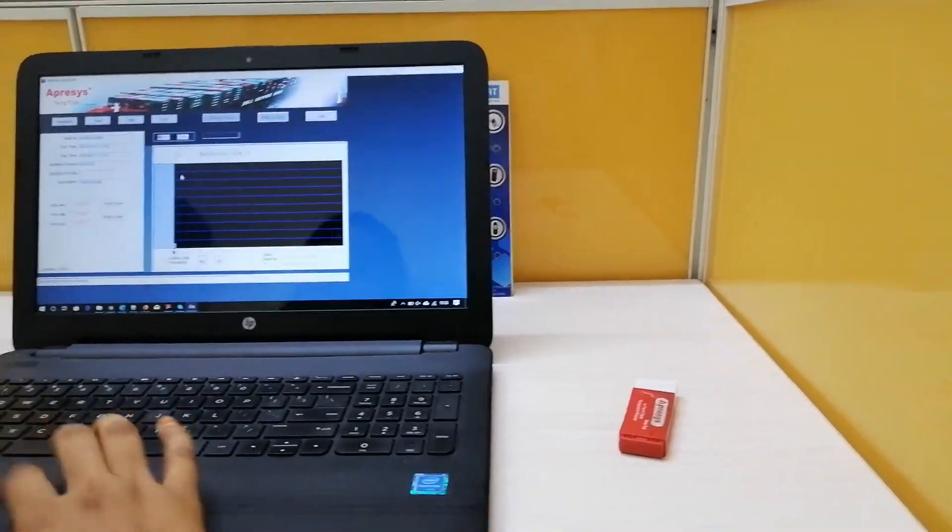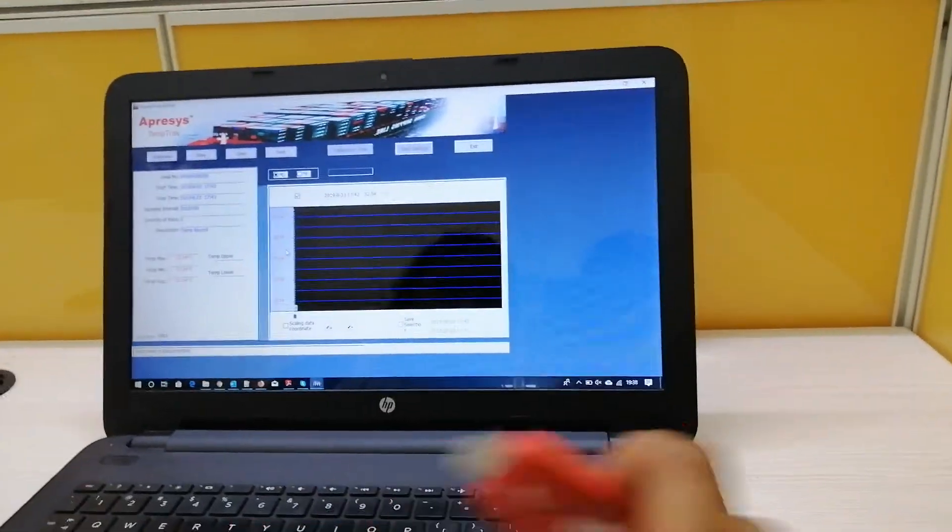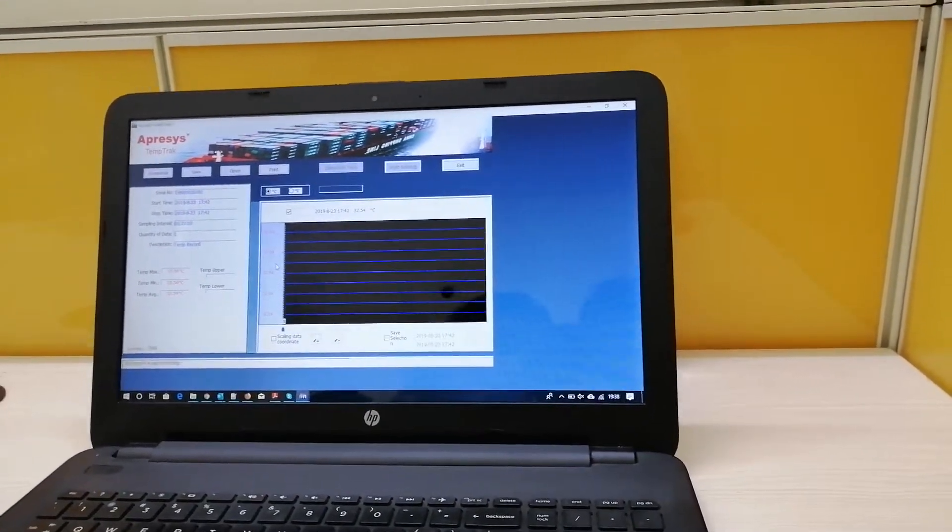This is the software. After starting the data logger, you have to connect to the PC to download the data.